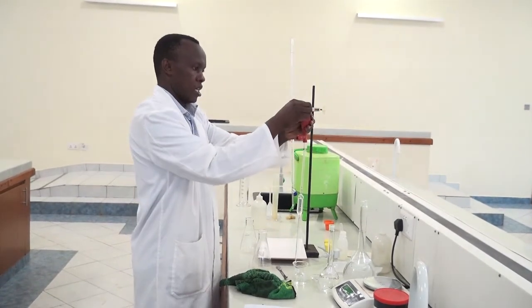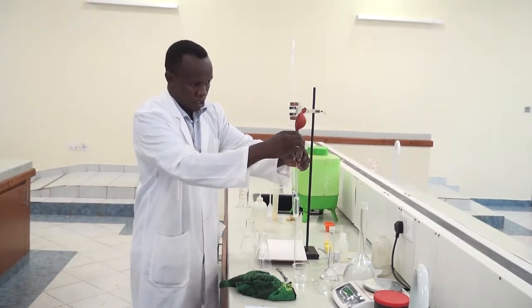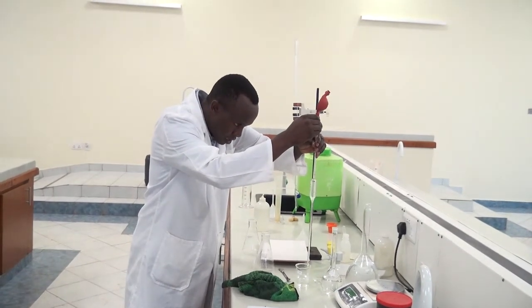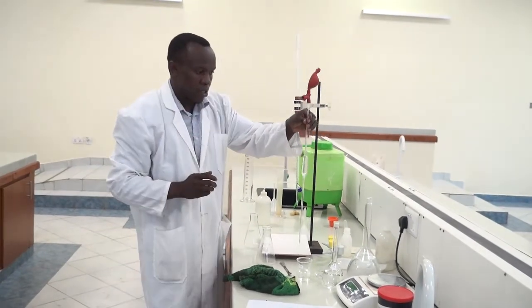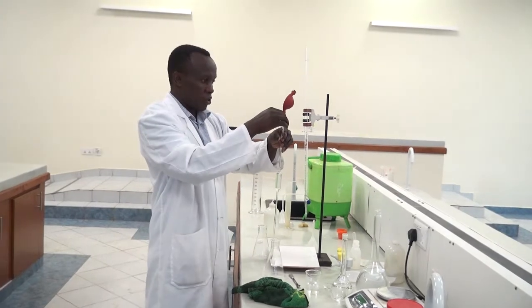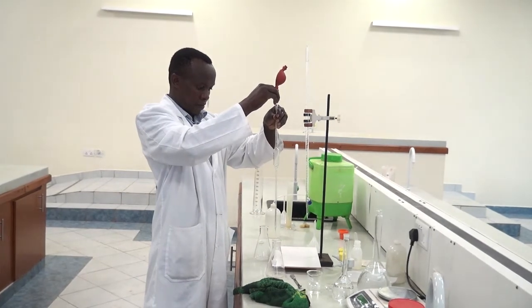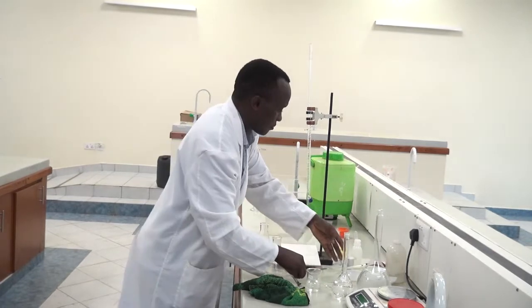Make sure that it surpasses the mark. Then you return it back to the mark. There I have pipetted my 25 mLs of sodium hydroxide. I transfer it to a conical flask.